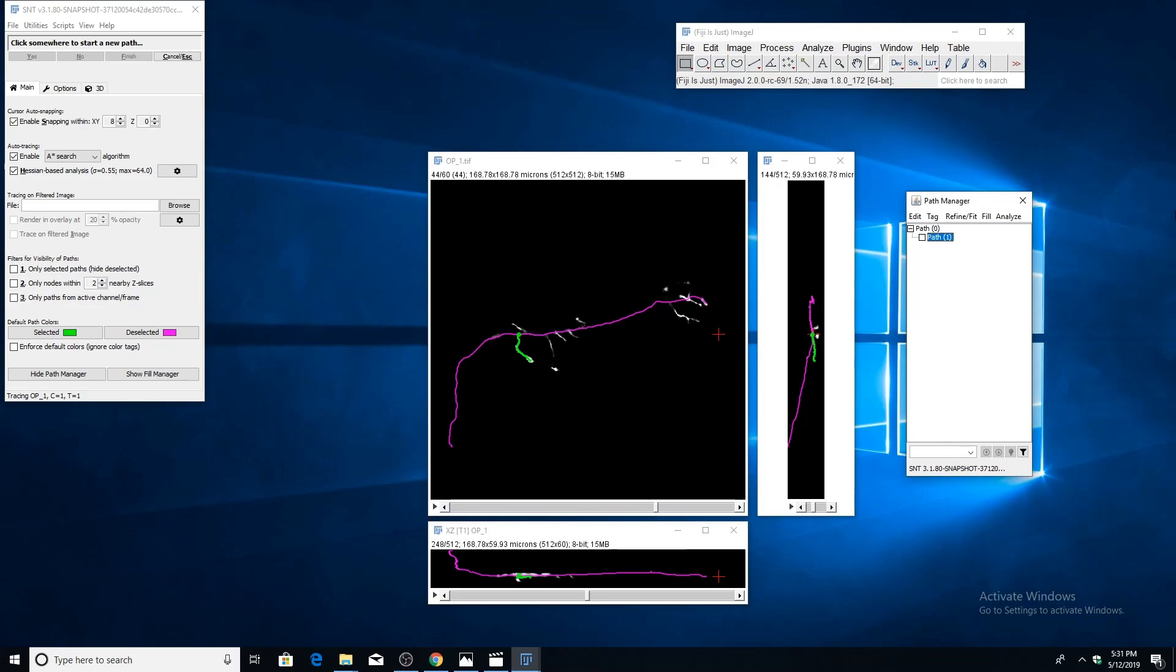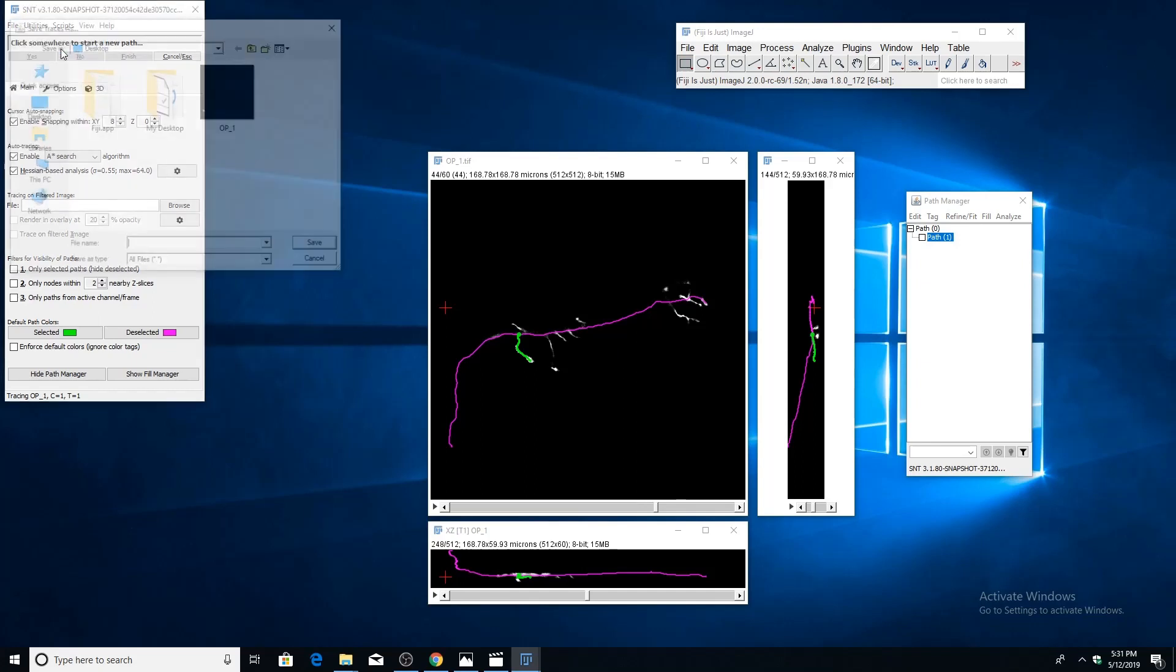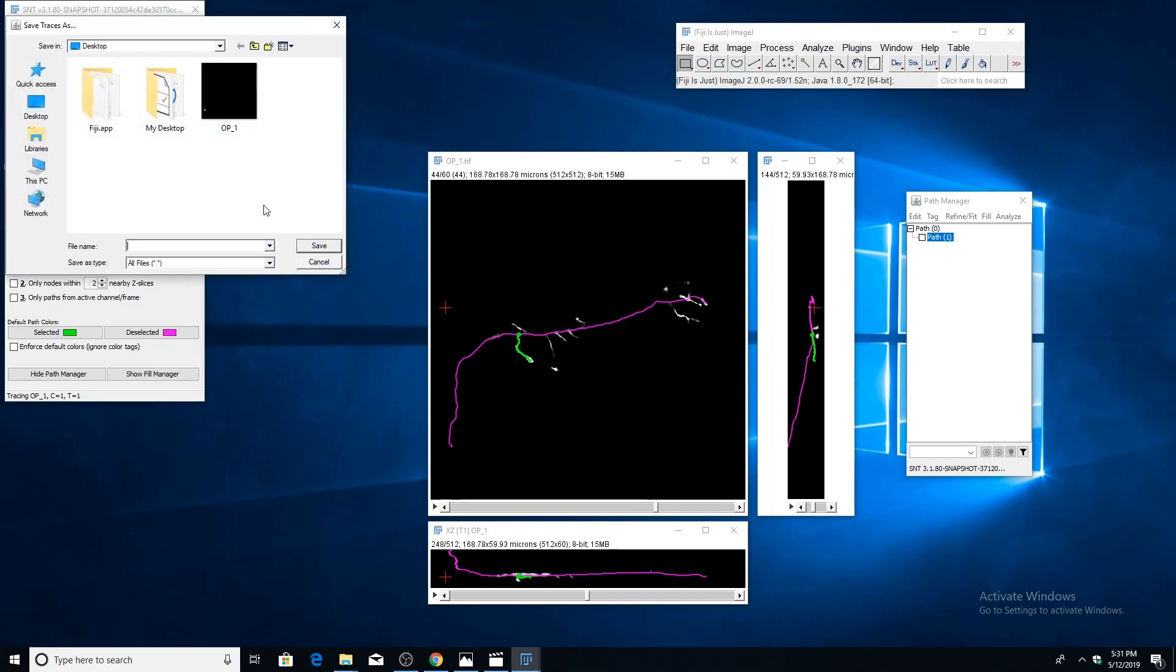That should give you enough information to start doing some basic tracing. There's just one more thing I want to go over in this video, and that is how to save your traces files. To do that, just go to the file menu, go to save traces. What I like to do is use the same file name as the image and then just add an underscore. Once you click save, it'll automatically add traces to the end of this file name.